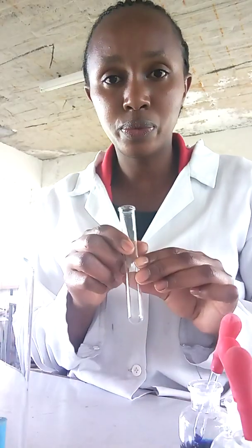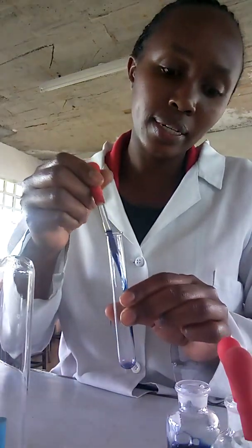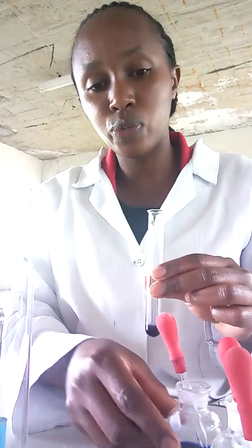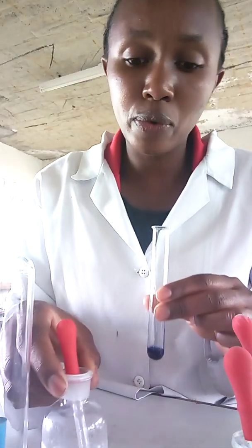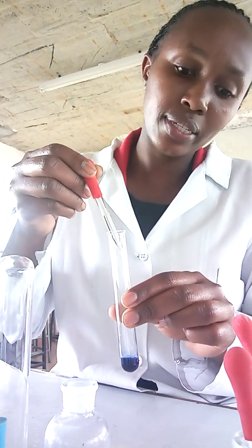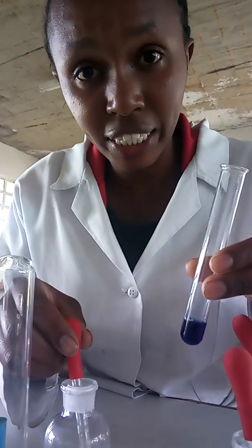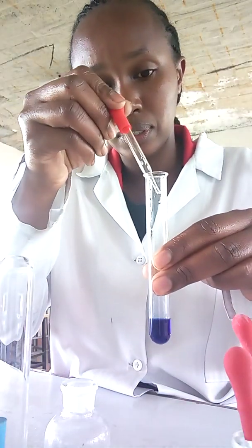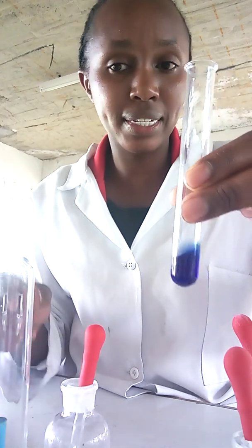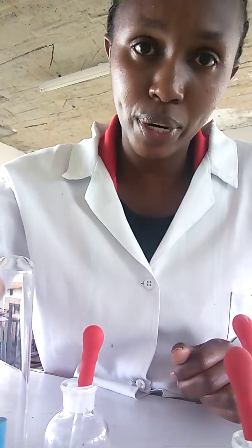For the first experiment, I'll take one test tube and put the DCPIP in first — that is the solution used to test — and then I'm going to take solution B and place it into the test tube. You can see the blue color is not changing, so this blue color is retained.